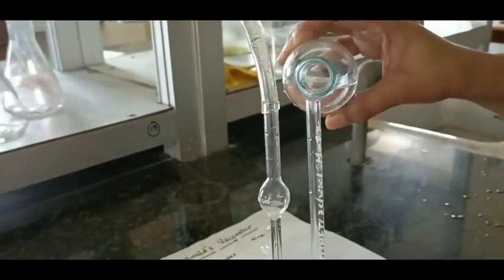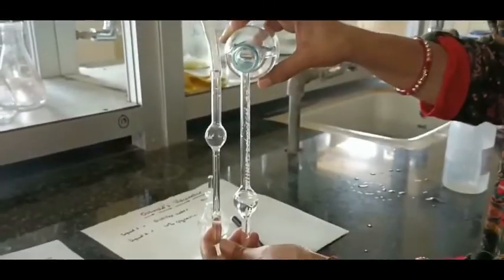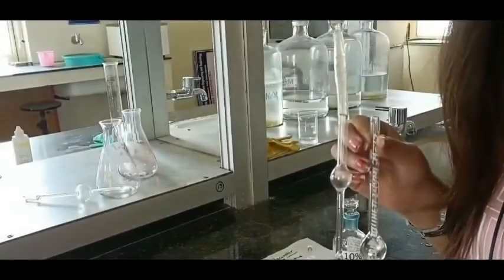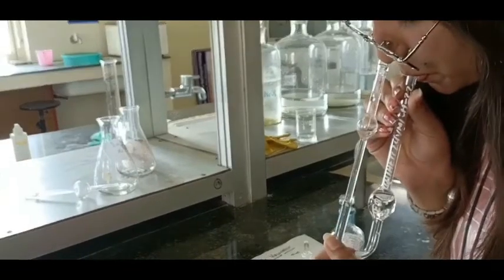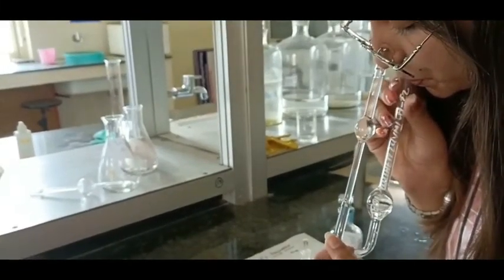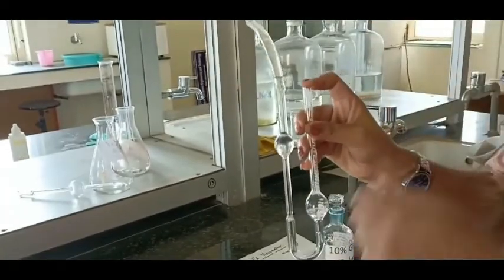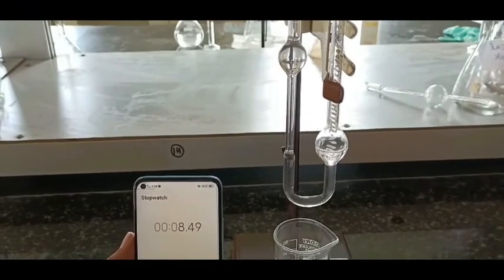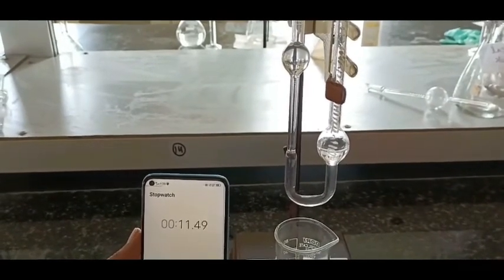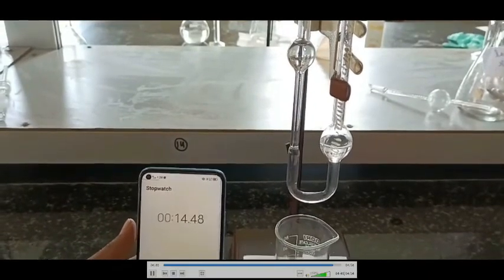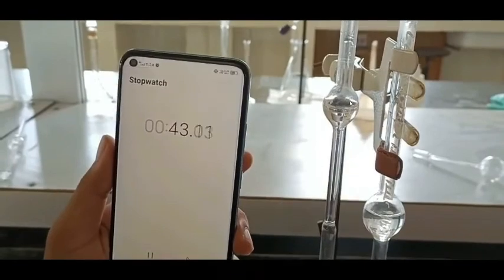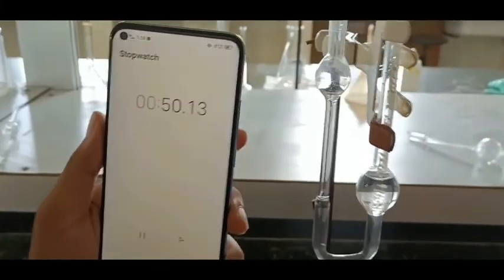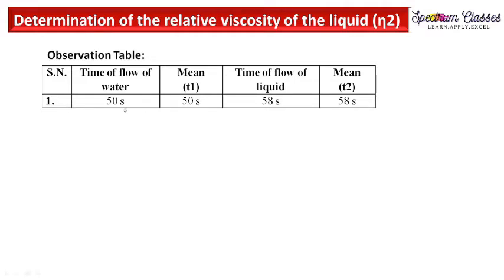We fill the viscometer and start measuring the time. You can see the liquid moving through the capillary. Now we fill the Oswald viscometer with 10% glycerin solution — first fill bulb B and then transfer the liquid to bulb A. With a finger on the rubber tube we can maintain the pressure. We then measure the time for the liquid level to flow between the two etched marks.